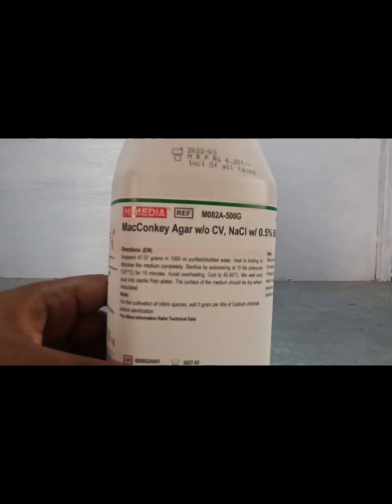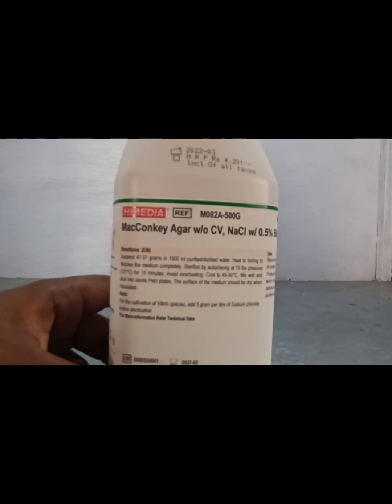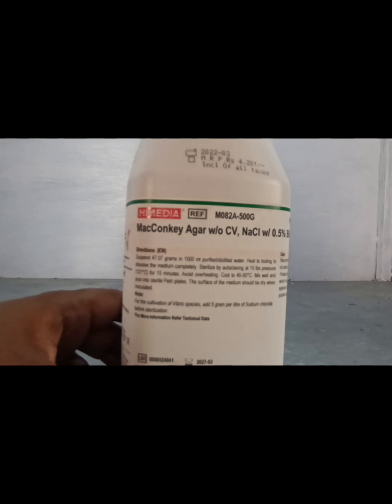As per the instructions, 47 g of powder needs to dissolve in 1000 ml of purified distilled water. We are taking 200 ml of purified distilled water, so as per calculation, 9.4 g of agar is required. We will take a few extra grams because at the time of measurement, some agar powder tends to stick closely to the paper, making it very difficult to remove. So we will take some extra amount.